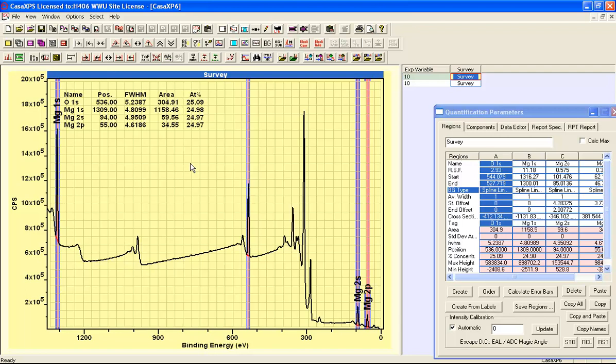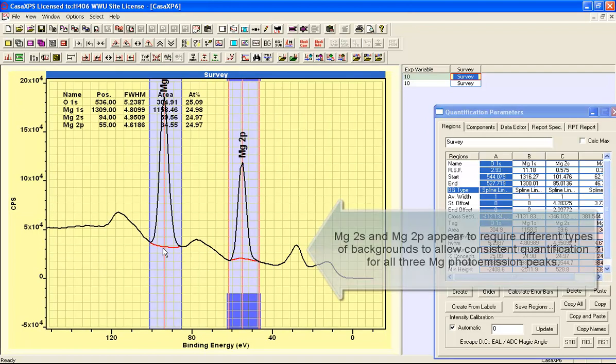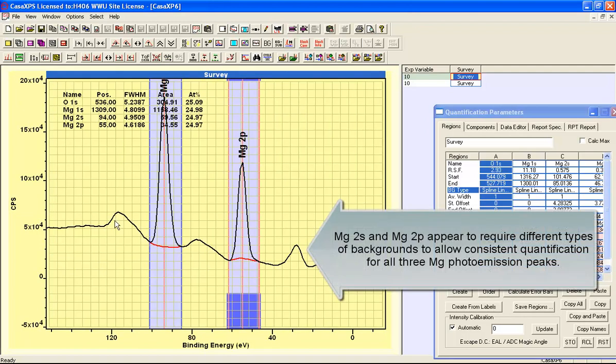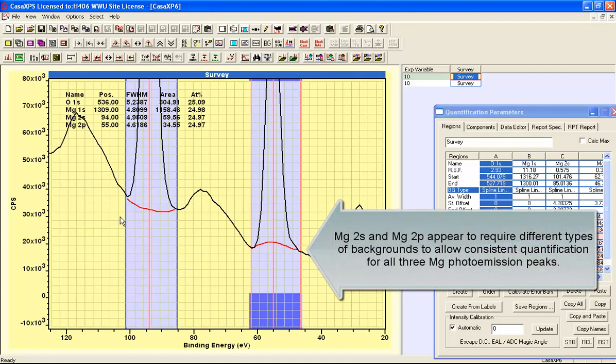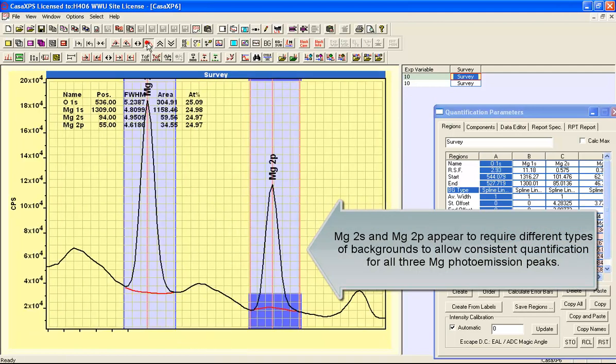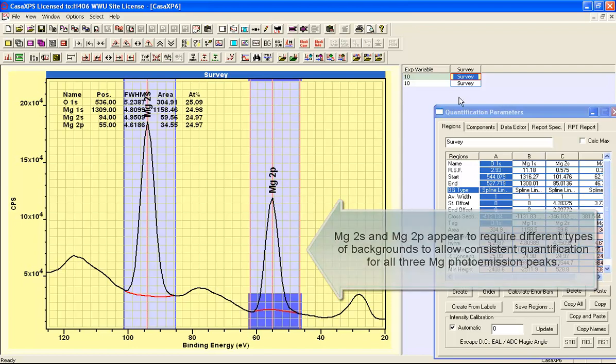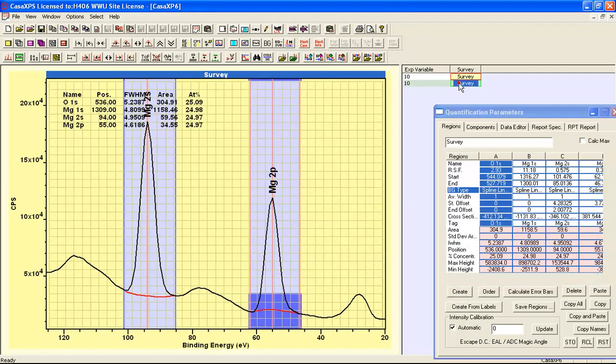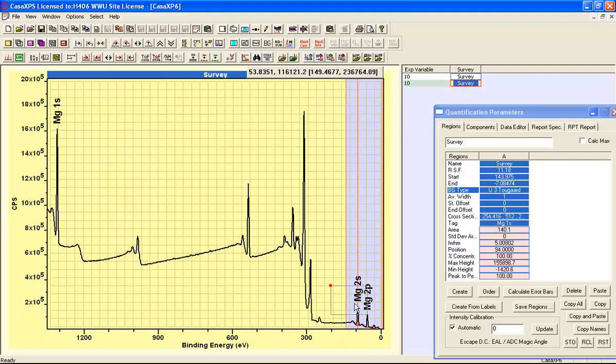So does this make sense to introduce backgrounds that have some kind of shape along these lines? You can see here, in order to achieve this quantification, I've had to use a concave up background for the magnesium 2s, whereas for the magnesium 2p I have a concave down background.